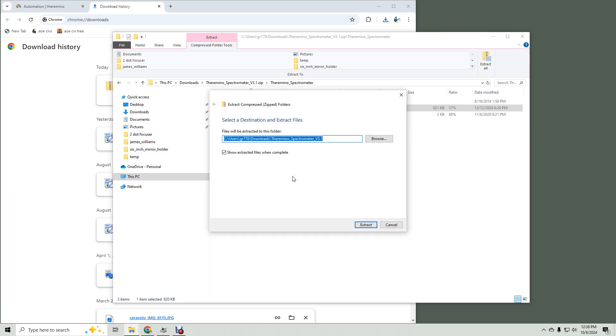Click 'Extract all' and choose where to put it. I don't want it in downloads, so I remove that. It's installed.